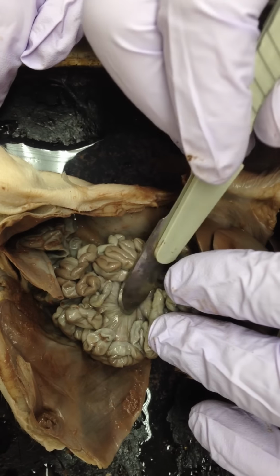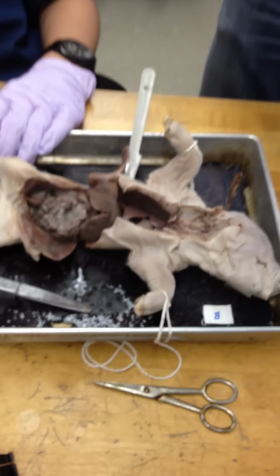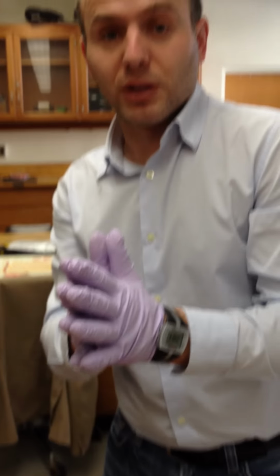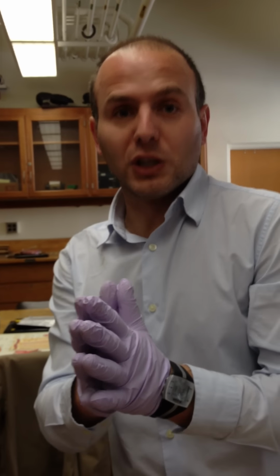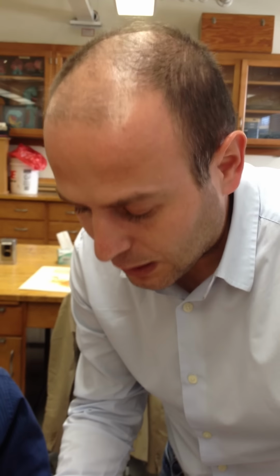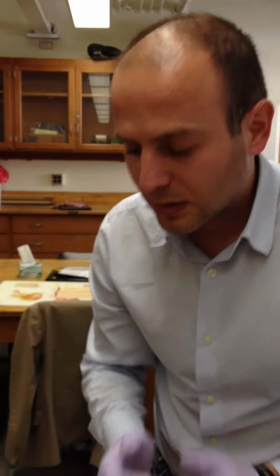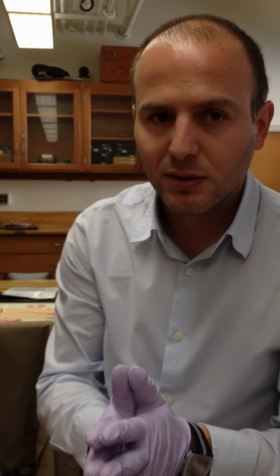That's just a serous membrane wrapping around, and inside those are all the blood vessels and nerves that go through to the intestines. In other words, the gut brain, most of its nerves are going through these mesenteries in between the two serous membranes. Inside, it's all loose areolar connective tissue, very delicate, with lots of interstitial fluid.